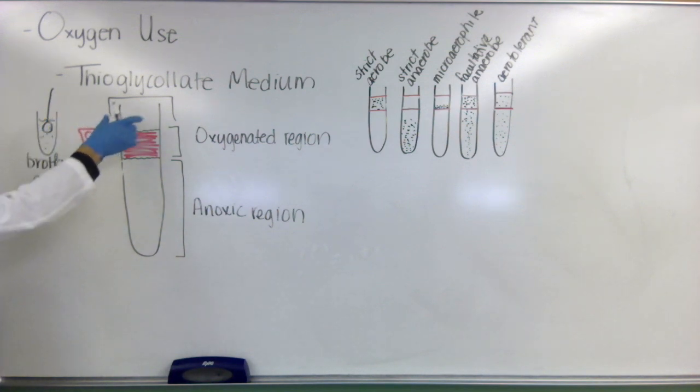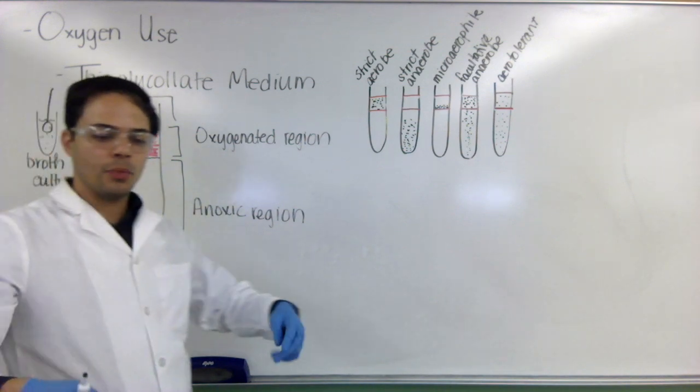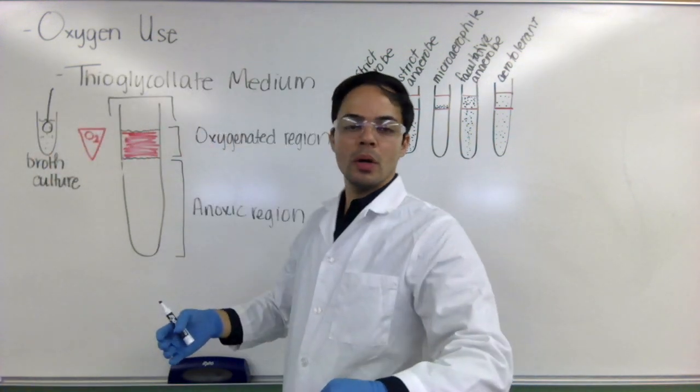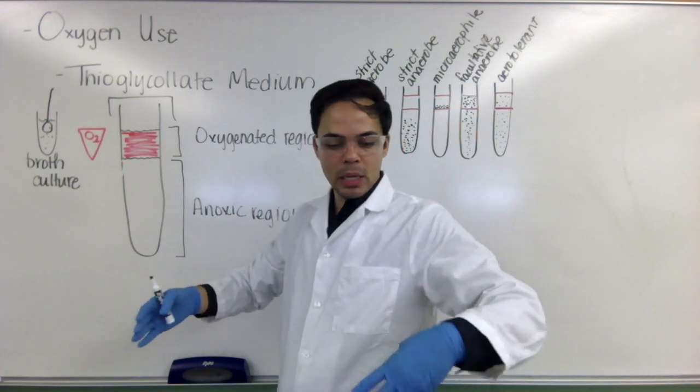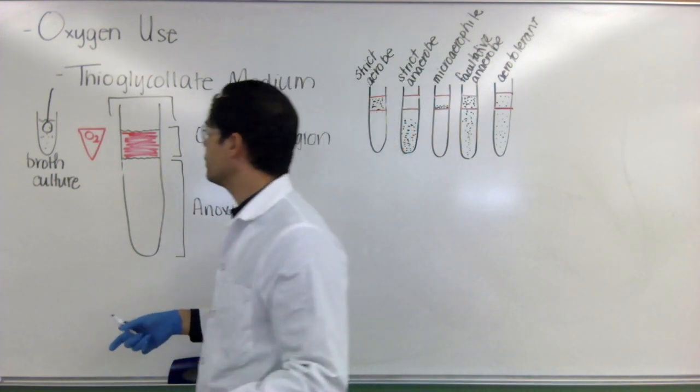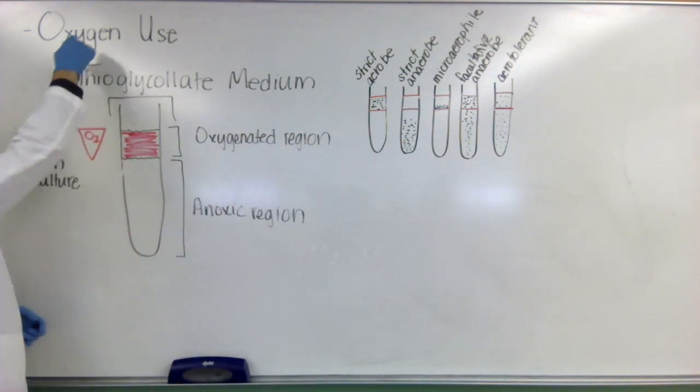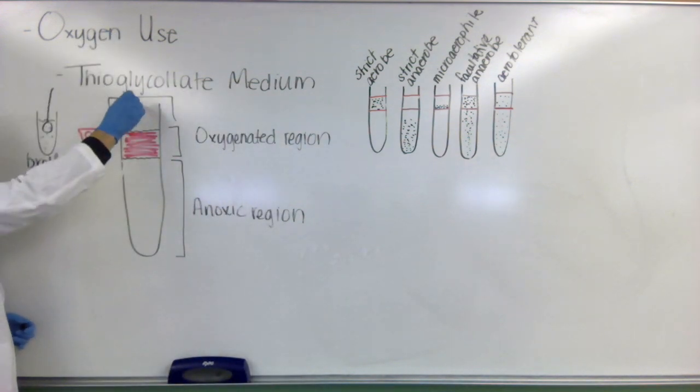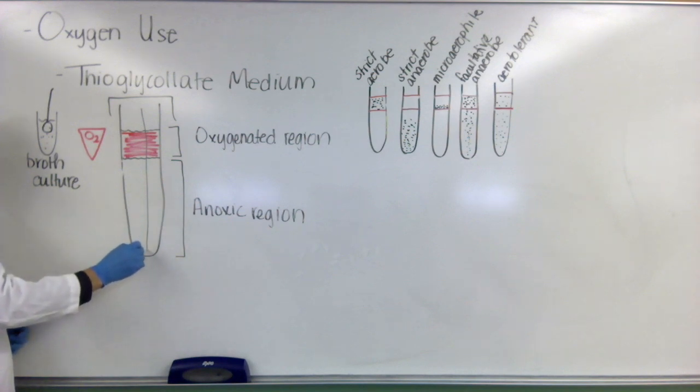And then we're going to take the cap off. Now only take the cap off in the region around your flame that has your semi-sterile area. Then you're going to just dip it straight down. So you dip it all the way to the bottom and then come back up.